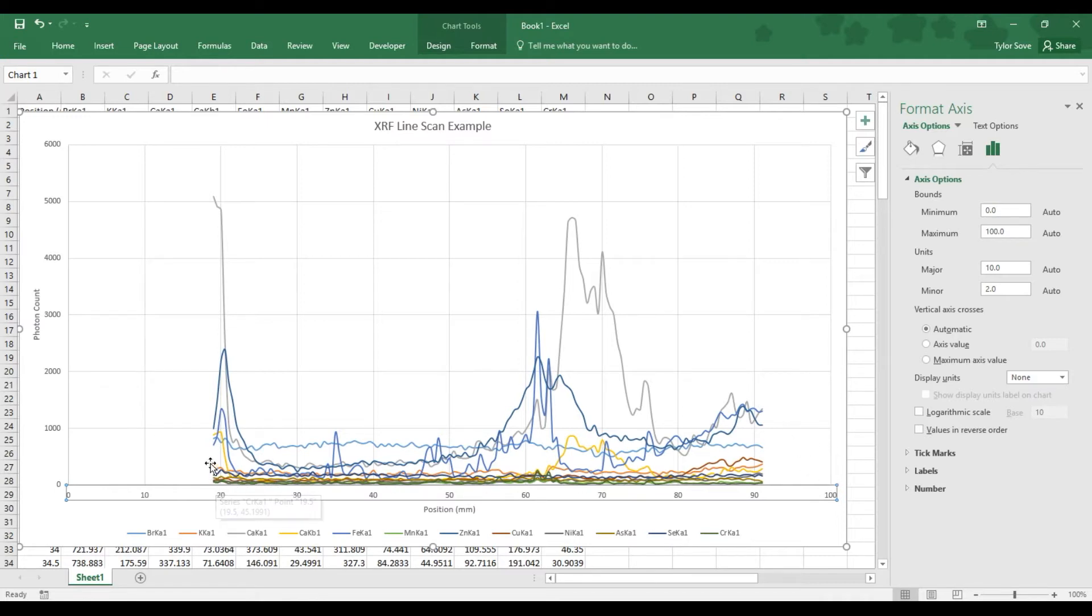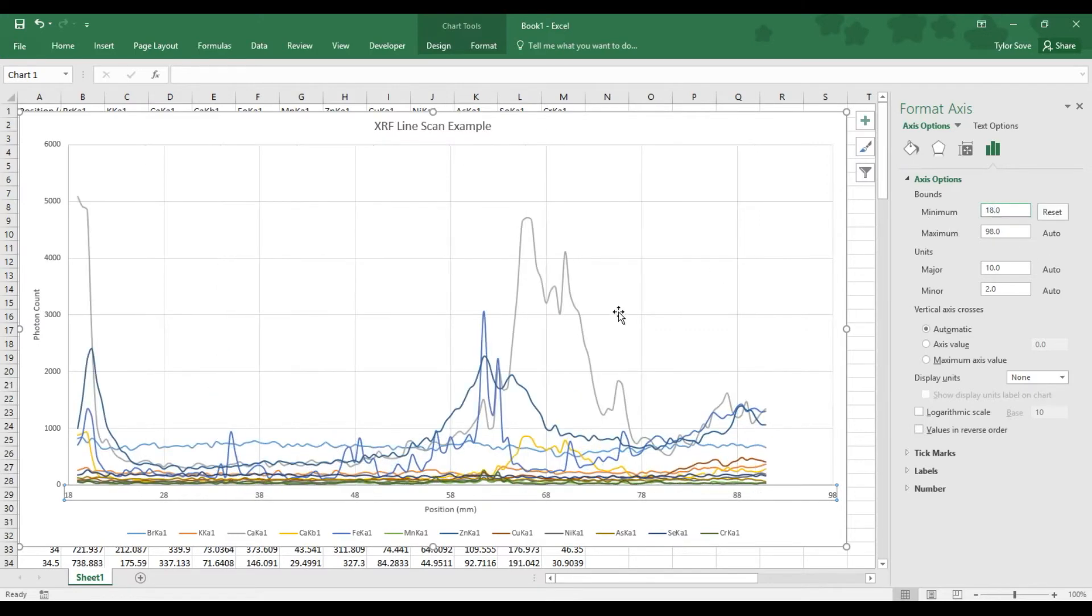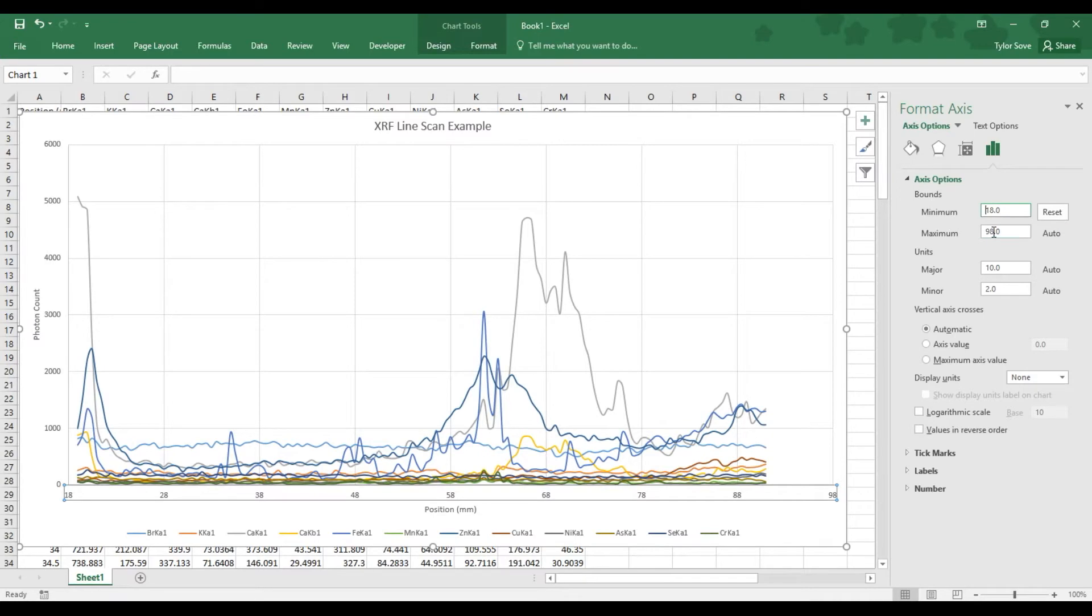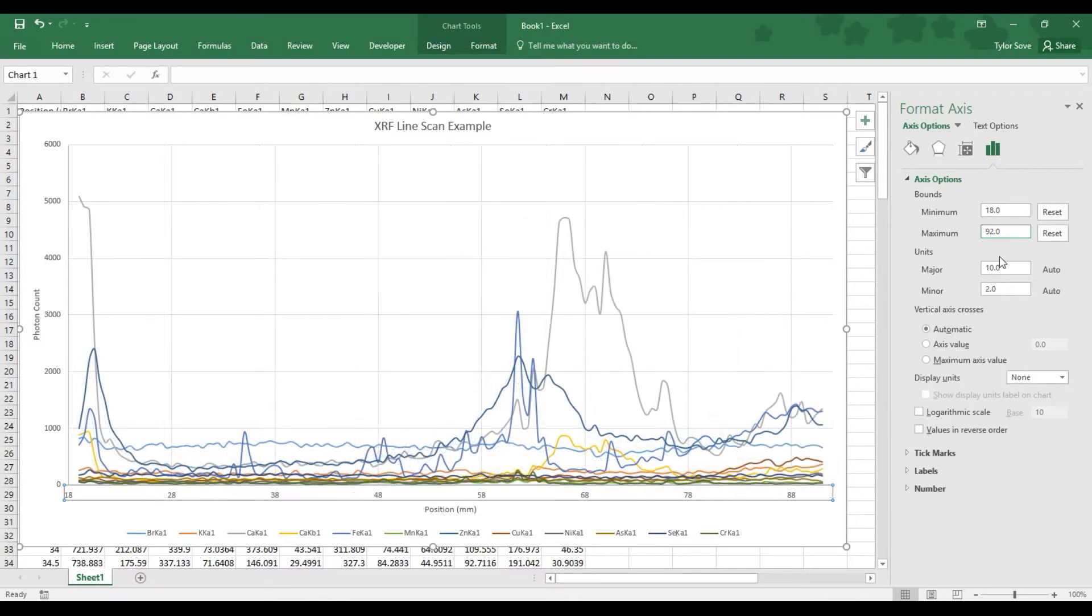So, our scan started at 19mm for this one. And so, I will set my minimum bound to 18mm, removing as much white space as I can. Now, the scan stopped at 90mm. So, I want to set mine to 92mm. Again, removing as much white space as I can.